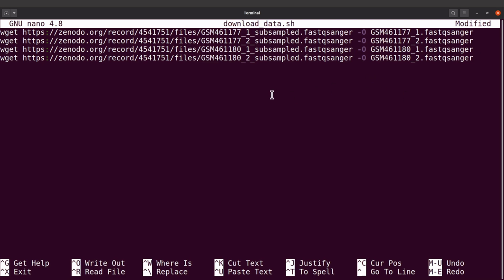You should also know that what I've done here, there is a better way of automating the download process, but because I'm assuming that some of the viewers may be beginners, that is why I'm trying to make it in this way so that you can understand whatever I'm doing. But there are ways to automate this process, okay, without you having to specify wget every time. But these are things that will be good for advanced people, but that's something that we'll cover in another tutorial.